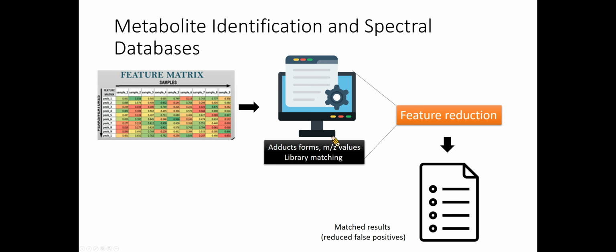The neutral molecular mass is inferred from the peak mass-to-charge ratio and depends on the chemical nature of the identified peak. Assuming no prior knowledge, each peak mass-to-charge ratio can lead to multiple plausible neutral molecular masses that can represent different ionization adducts. This multiplicity often results in a high number of false positive identifications.